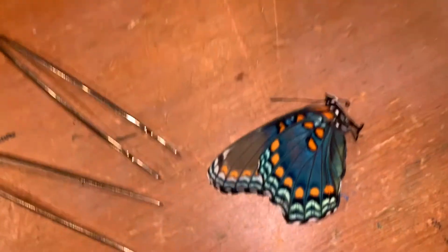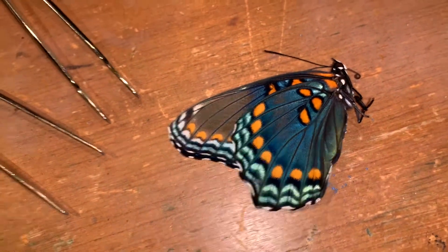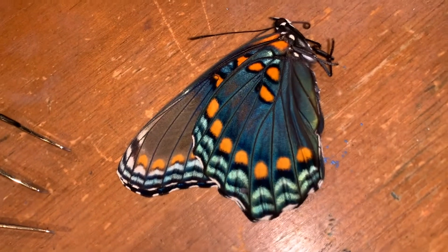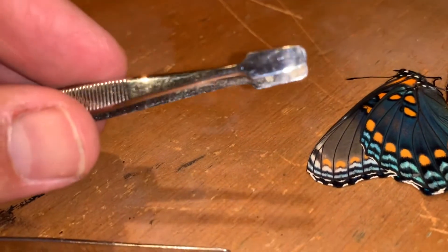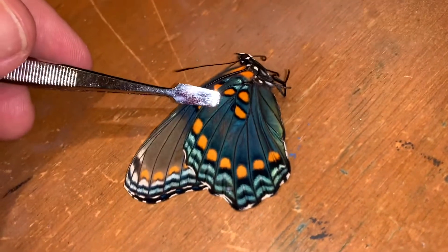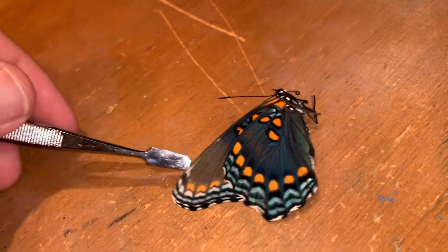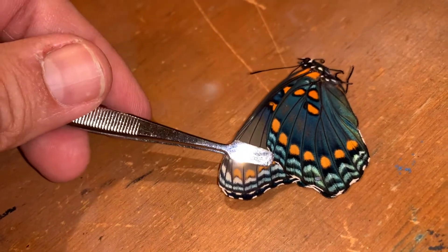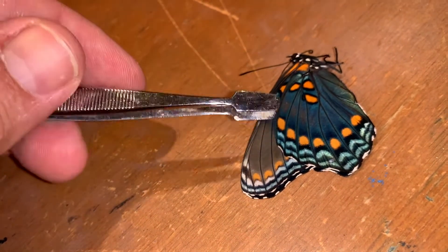Here's our first specimen — this is a red-spotted purple female. I'm going to pick it up, not with my fingers, using forceps. These are butterfly or spade-tip forceps, and you can use these very nicely to handle your butterfly. You never want to pick your butterfly up by the outside of the wings, because the weight of the butterfly is near the body, and if you pick it up at the wing tip the wing is going to bend or even kink.